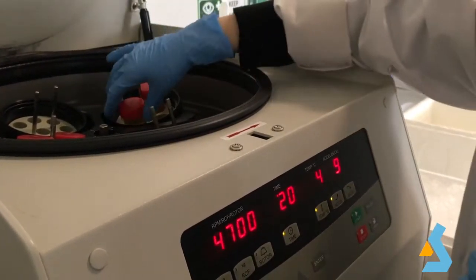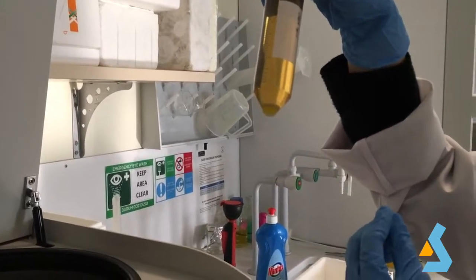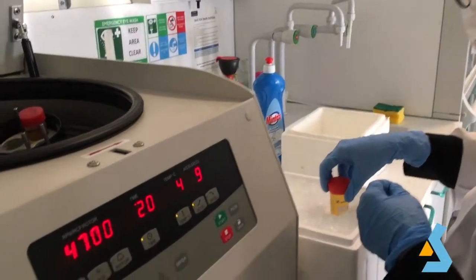After the centrifuge, we observe a bacterial pellet and a clear supernatant. Discard the supernatant to a bacterial waste and place the tubes on ice.